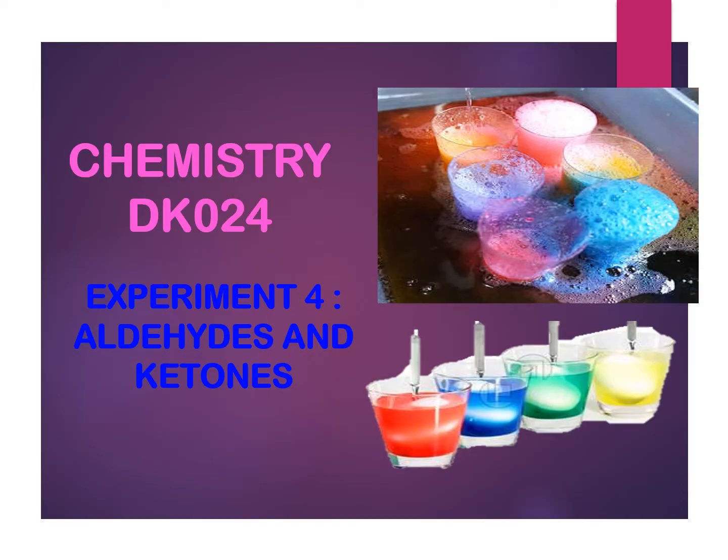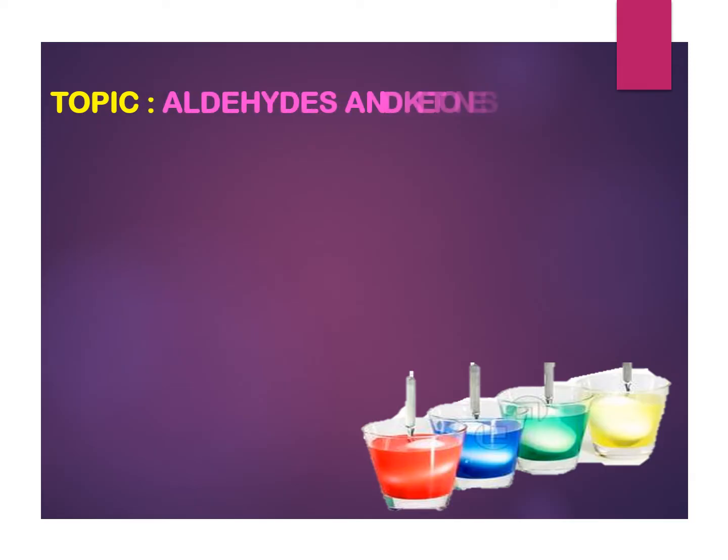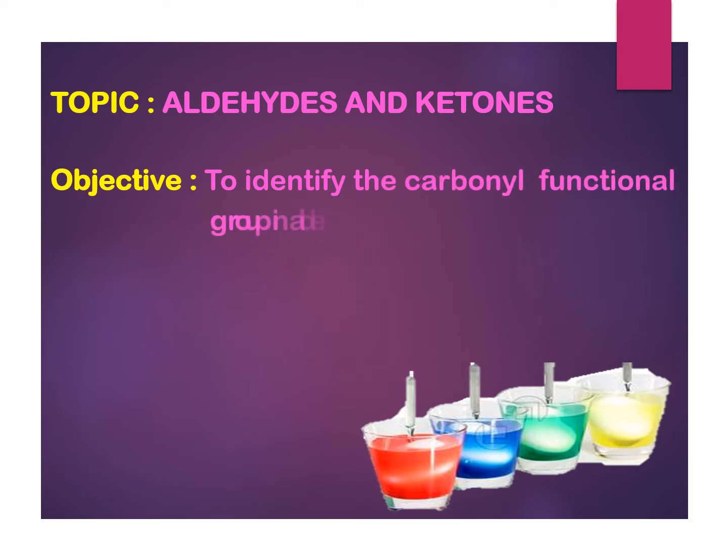For the chemistry DK024 post-lab activities for the experiment for aldehydes and ketones. The topic for this experiment is aldehydes and ketones. The objective of this experiment is to identify the carbonyl functional group in aldehydes and ketones.